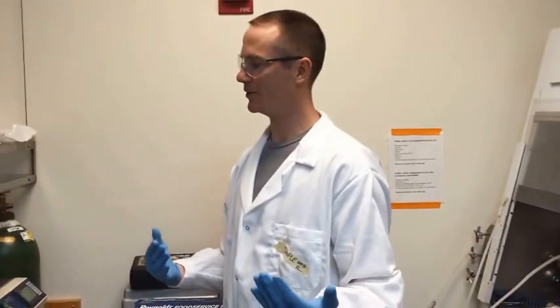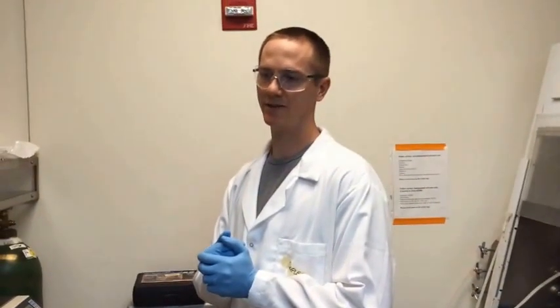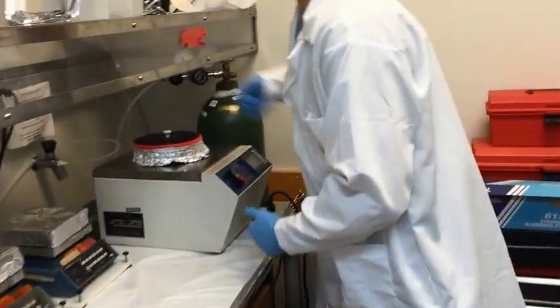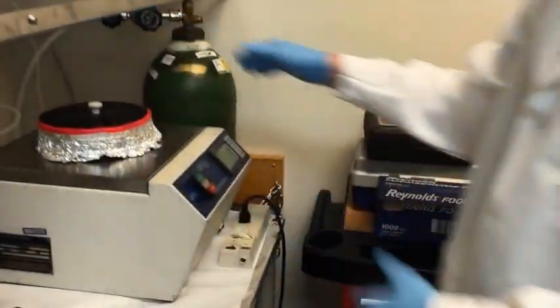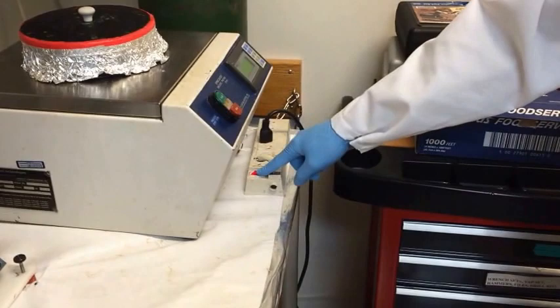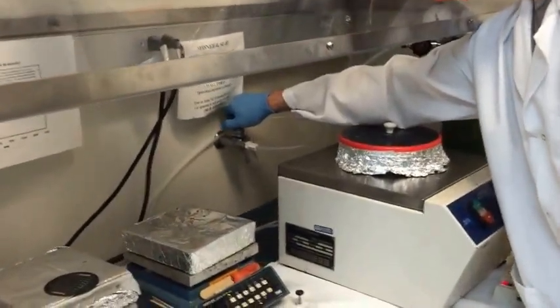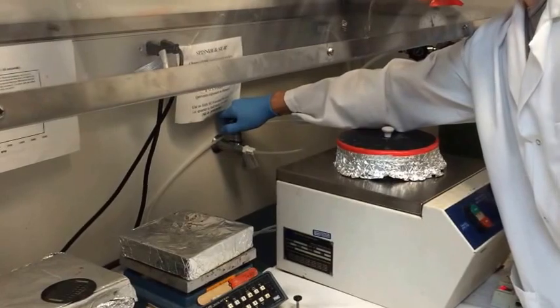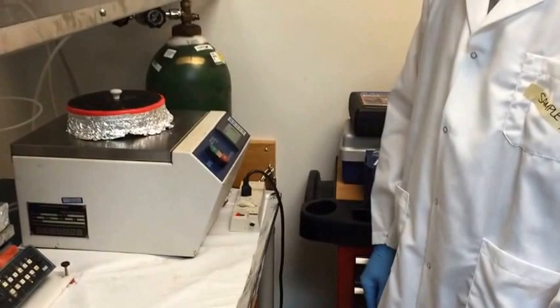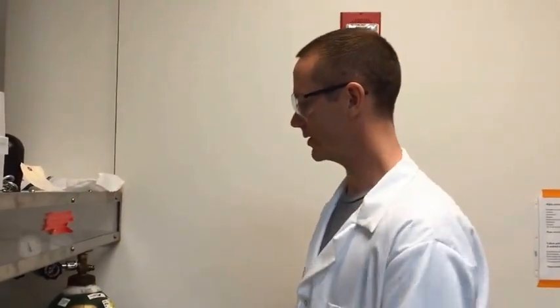The next step is setting up the spin coater with your settings. When you walk up to the machine and try to switch it on with the power switch, typically nothing will happen. In order for the device to turn on, you need the vacuum engaged. You turn this on until you can barely hear the whisper of air indicating you have enough vacuum on the system, and now the system should be on and ready for you to program it.